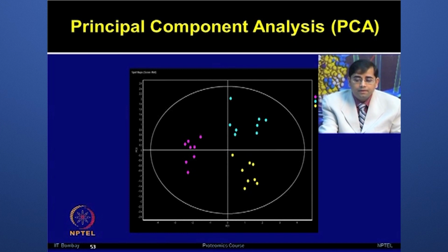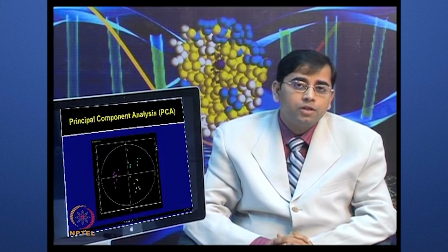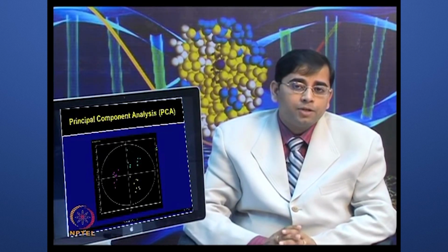As you can see here, the red dots are showing the controls and blue and yellowish dots are showing 2 different types of treatment groups. So, now these 3 groups are clustered quite closely. There will be some heterogeneity because of the different clinical samples and patients' biological variations involved, but overall it shows that data is quite statistically significant in the experimental groups.